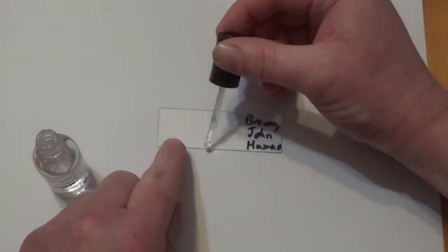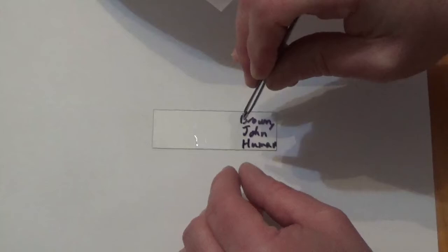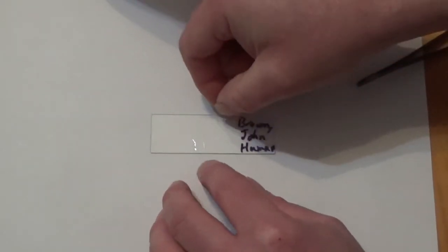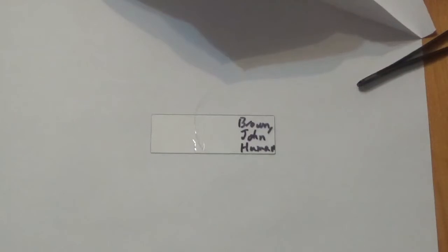I'm going to take a single clear layer of nail polish, a thin layer, and a sample of hair. I've obtained a single hair, and I'm just going to lay the hair down in the nail polish. Carefully not to wiggle it around too much. I'm just going to lay the hair into the clear nail polish, and it will dry and form an impression. We're going to let it dry for about 10 minutes.